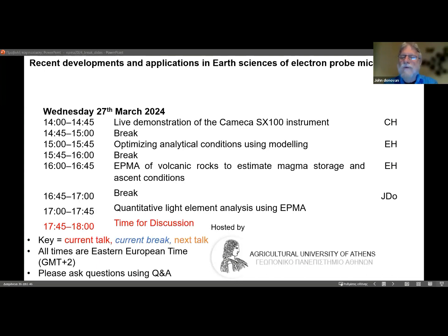I know, I'm joking, but the answer is for a very specific reason. And the reason is that, about 10 years ago now, I worked for a long time with Mike Jercinovic at University of Massachusetts and Julien Allaz, who was a postdoc there at the time. Now Julien's at ETH Zurich. And we developed a method called multi-point background.